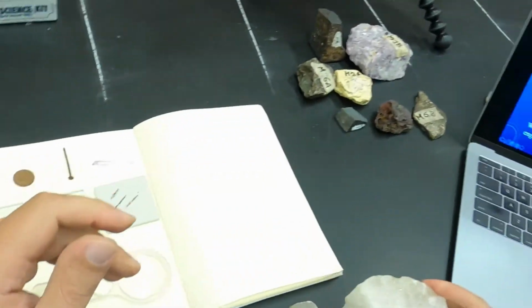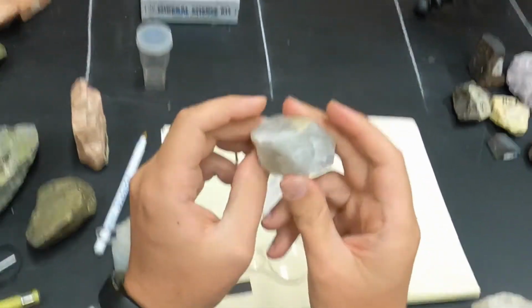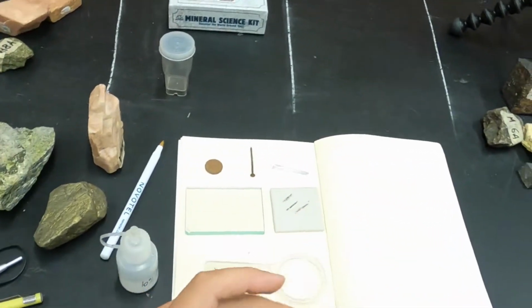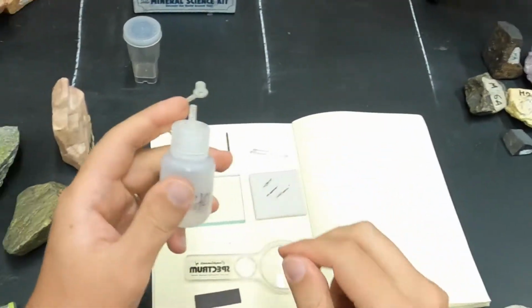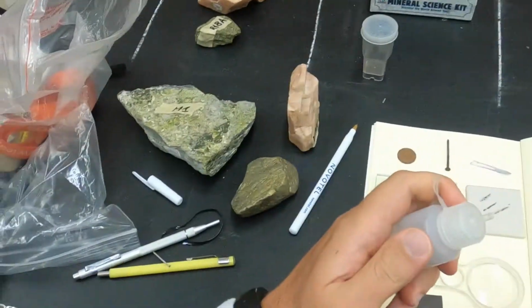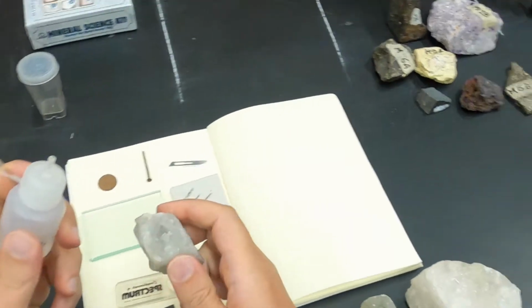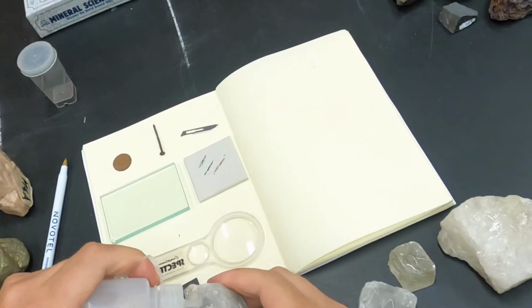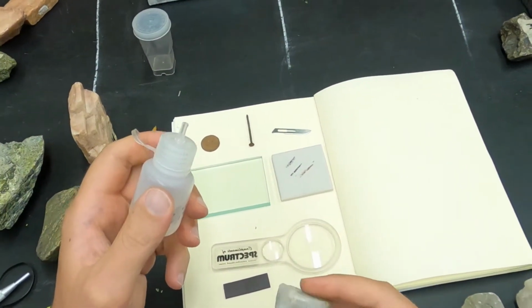Then you have this one here, which is also usually not responsive, because this is a salt, an ionic compound, essentially composed of fluorine and calcium, but it doesn't give you any fizzing at all.